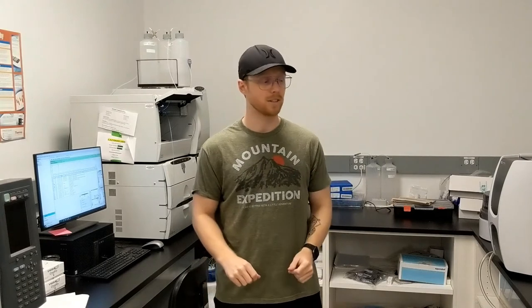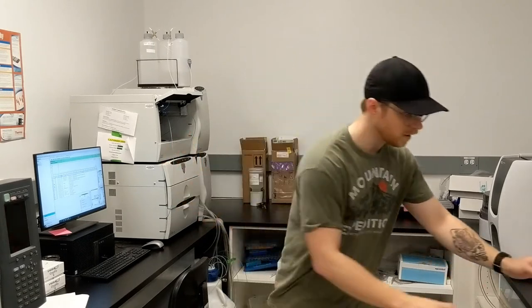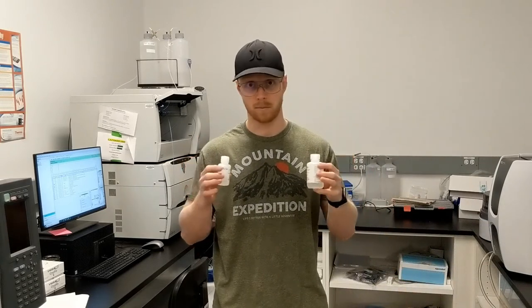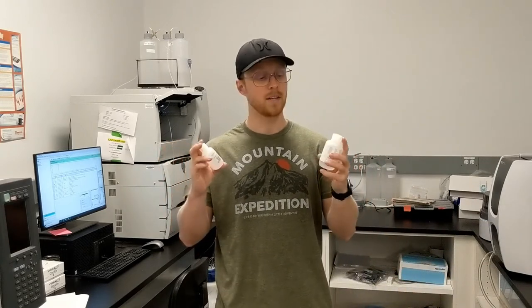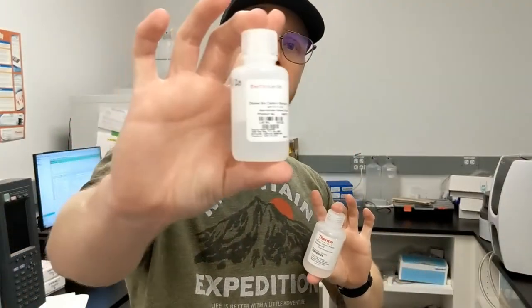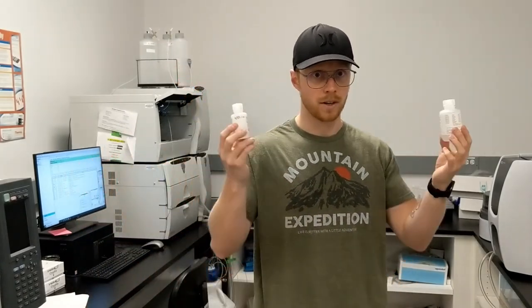Once your samples are in the right vials, you need to make a calibration curve. The easiest way to make one, if you're not making it from raw salts, is by using the Dionex 7 anion standard and Dionex 6 cation standard. These have different concentrations of different ions in them, and you can easily dilute them to the values that you need.